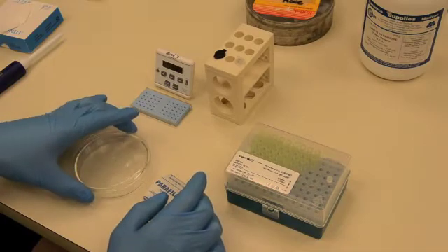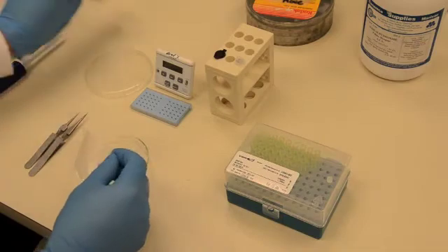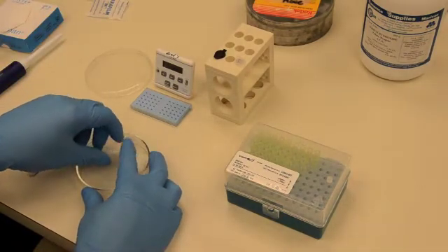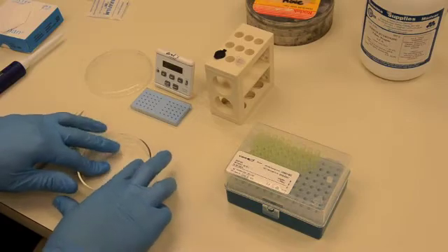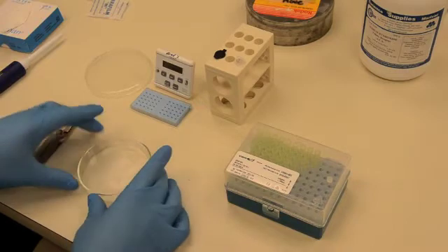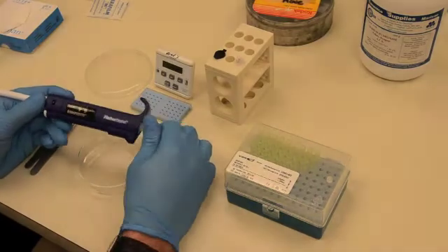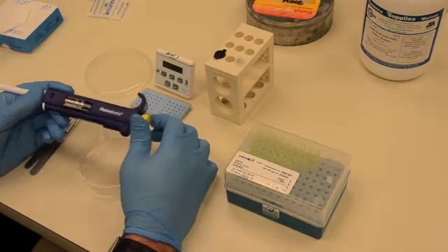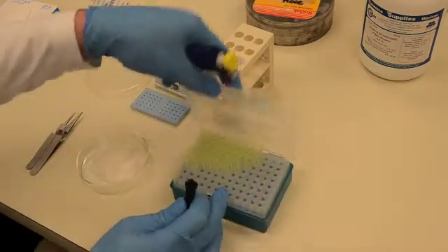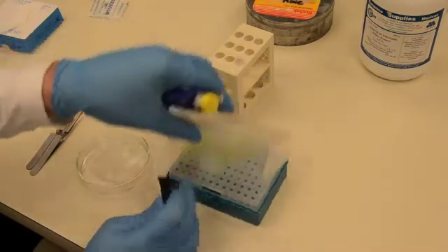To begin, take the parafilm and place it on the bottom half of a petri dish. Be sure that it lies flat. Next, pipette 20 µL drops of uranyl acetate stain onto the parafilm, one drop per grid. The uranyl acetate must be stored in the dark black tube and centrifuged prior to use.